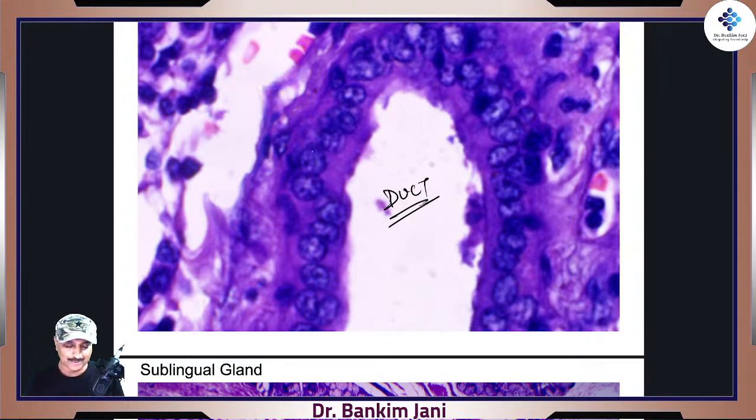This is like a parotid gland, the parotid duct through which those salivary secretions are coming. But how beautiful they look, right? Gradually, as we discuss more and more topics in parallel, because somehow I feel that you guys are enjoying this histology part. Sometimes people say that it is very boring, but I feel this inner world is so beautiful, right? So we'll keep on watching it.